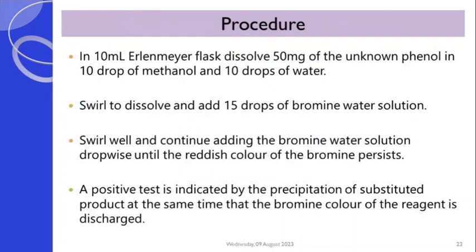Let us look at the procedure. You would have to dissolve about 50 milligrams of the sample that contains the phenol.